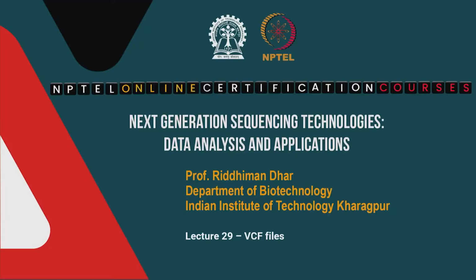Good day everyone. Welcome to the course on next generation sequencing technologies, data analysis and applications. We have been discussing variant calling. In the last few classes we discussed methods on how to call variants, different types of variants, and we specifically focused on single nucleotide polymorphisms or SNPs or SNVs and small indels. We also tested with a script how to call these SNPs or SNVs and small indels from the SAM output file through a multi-step process.